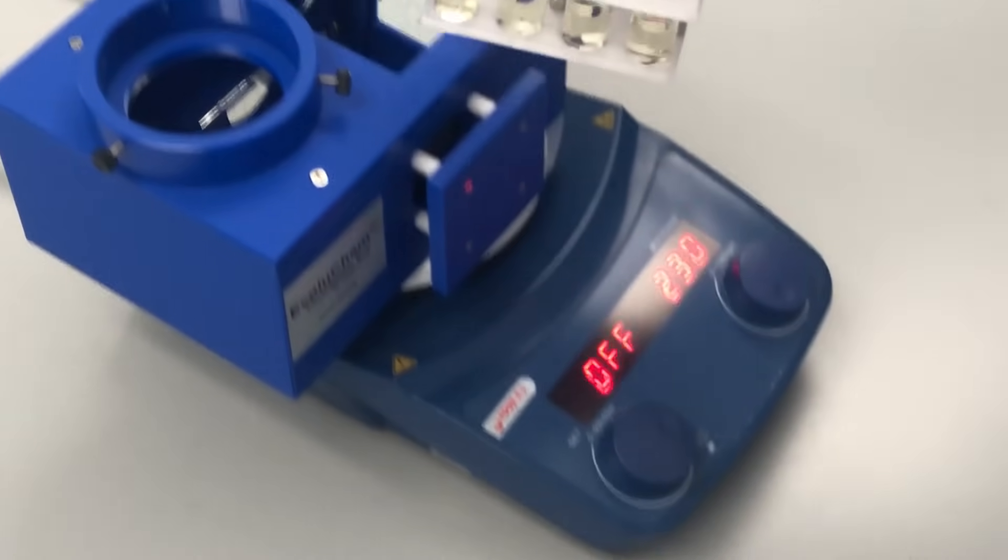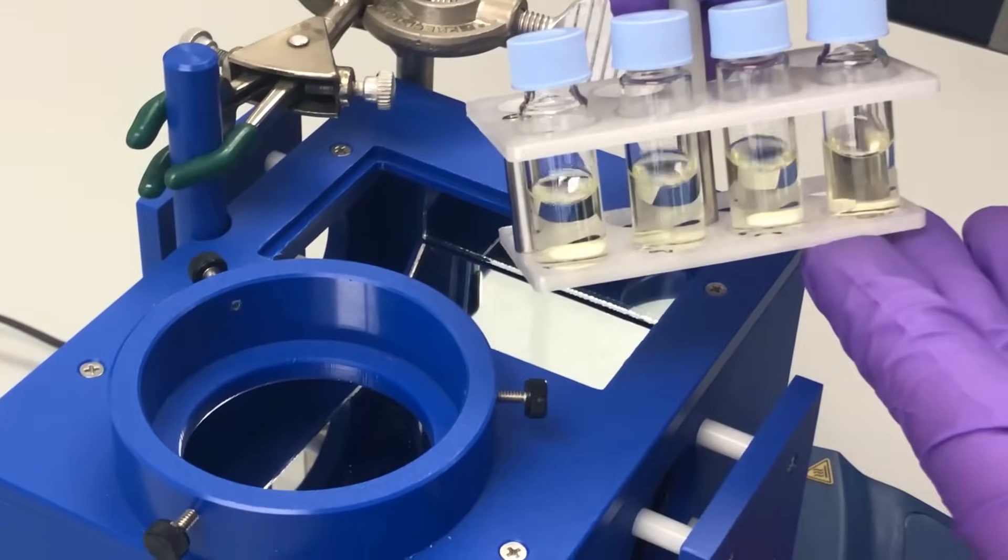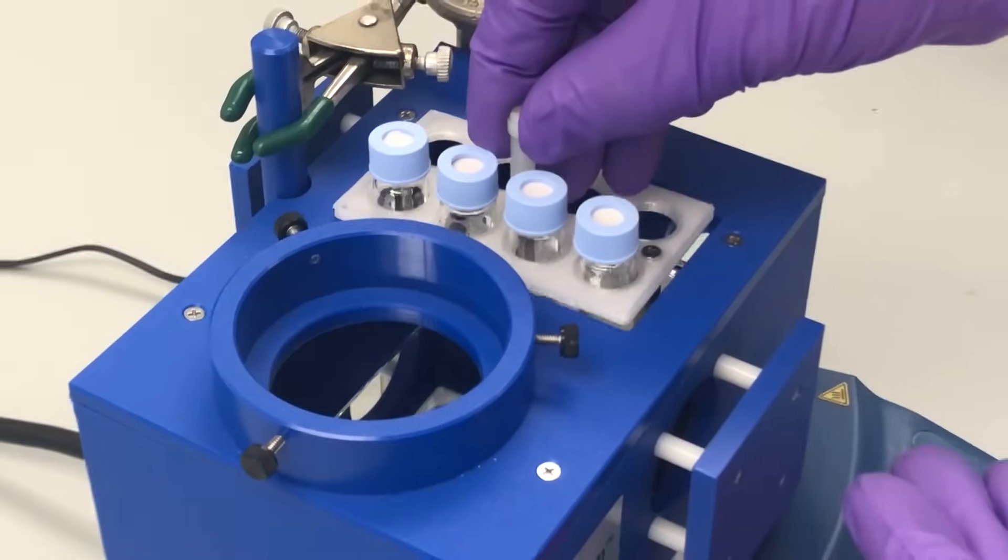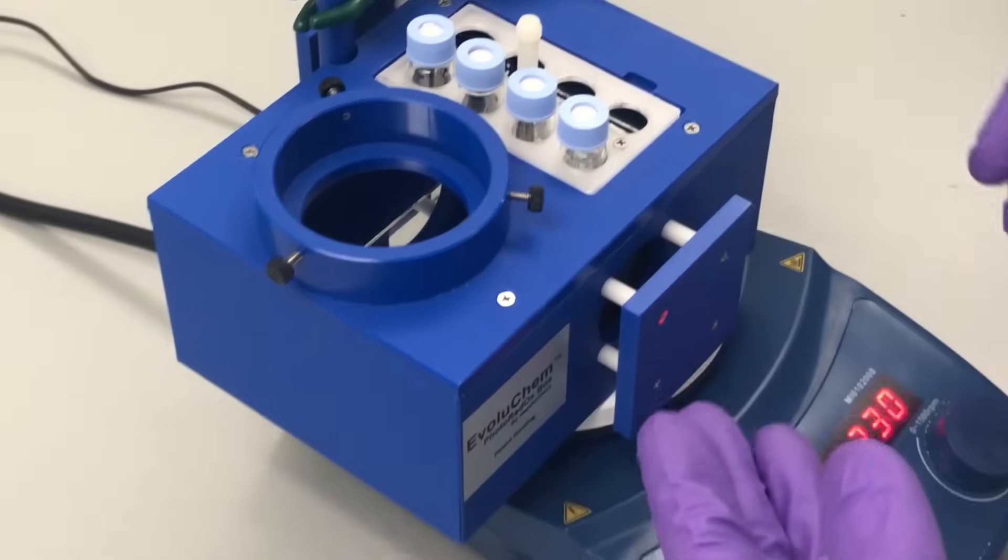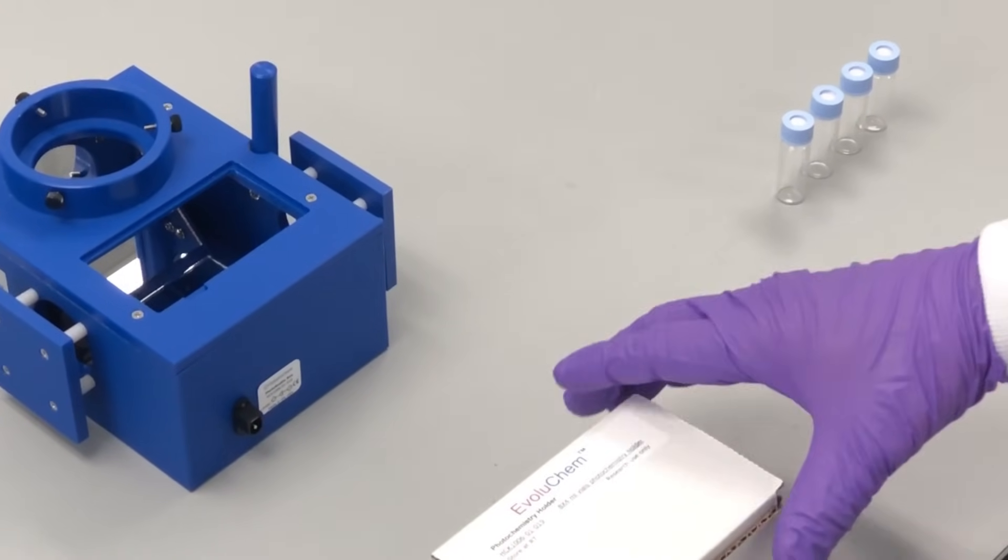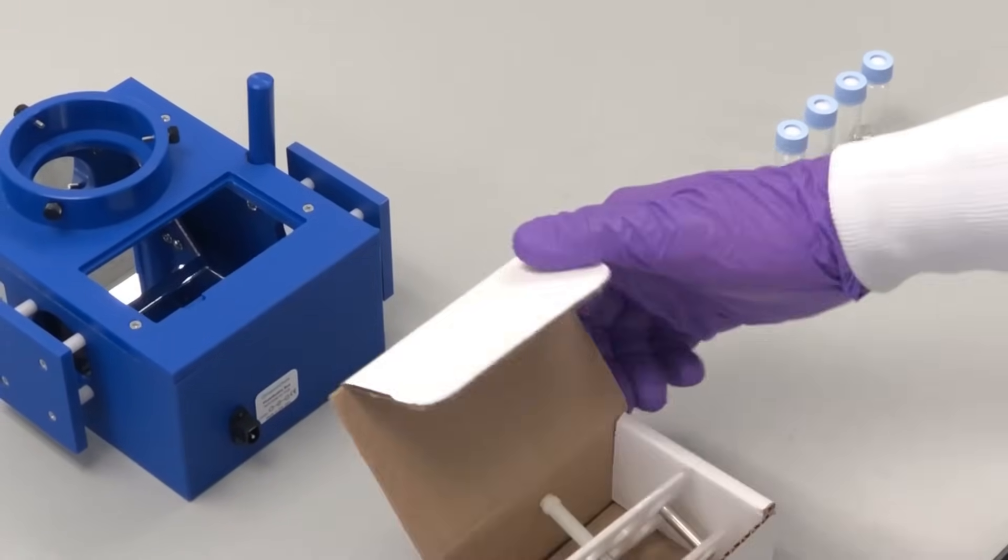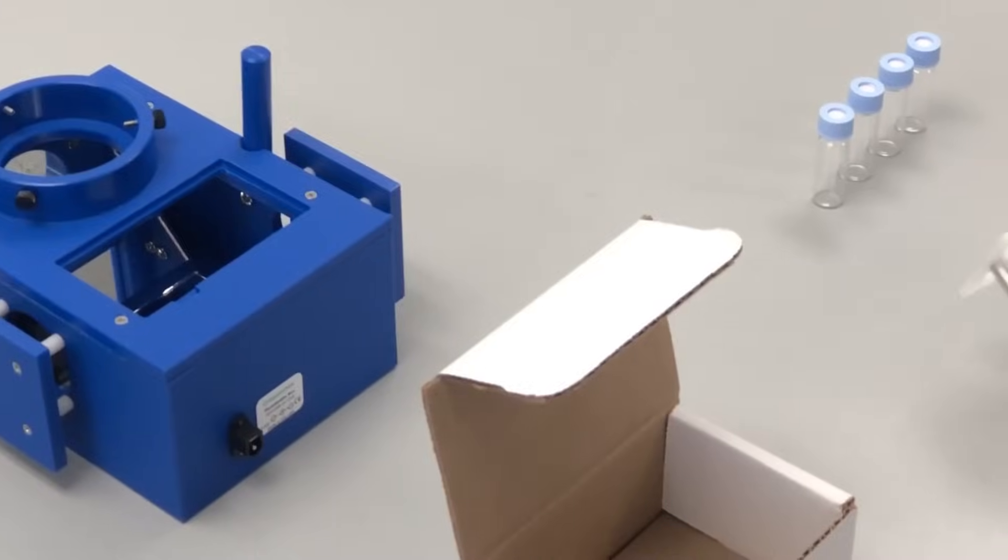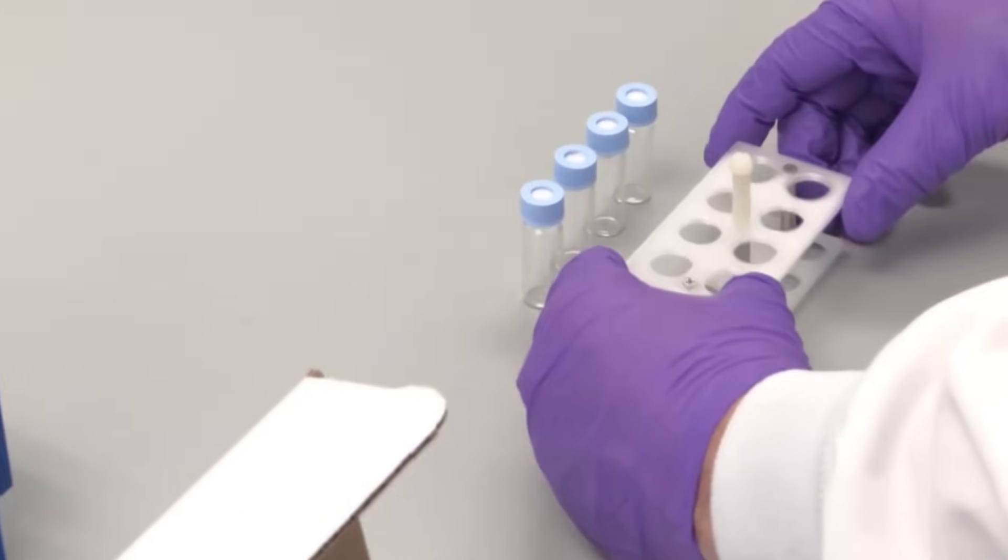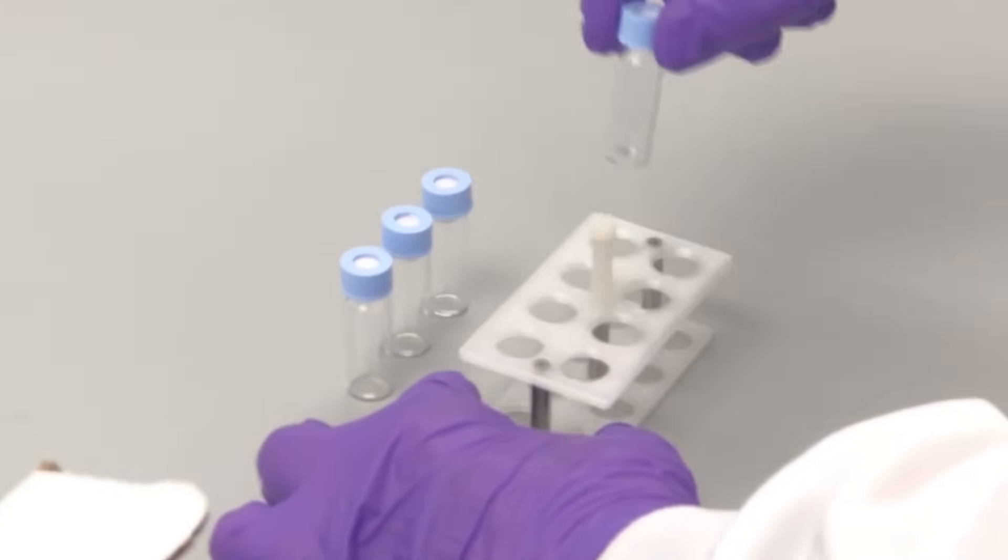EvoluChem offers several vial holder options for our photoreactors enabling anywhere from two up to 16 simultaneous reactions depending on the size of the vials. Each vial holder can be ordered separately and comes in its own package. Your vials can be easily loaded into the holder and then placed into the photoreactor's reaction chamber.